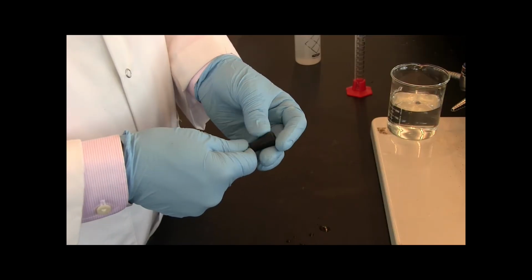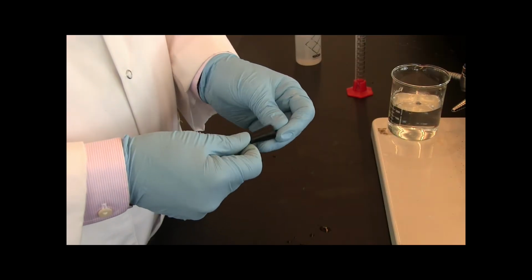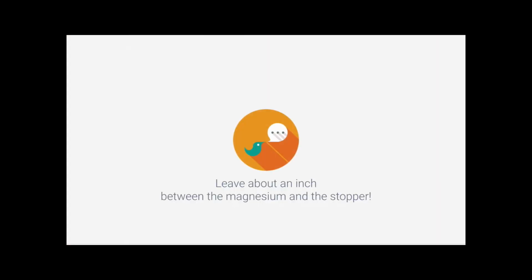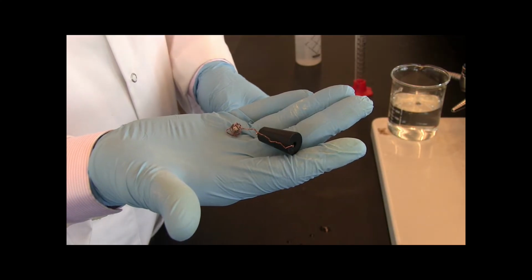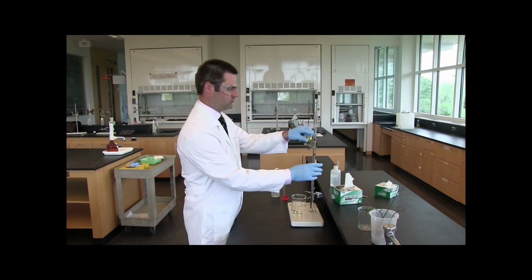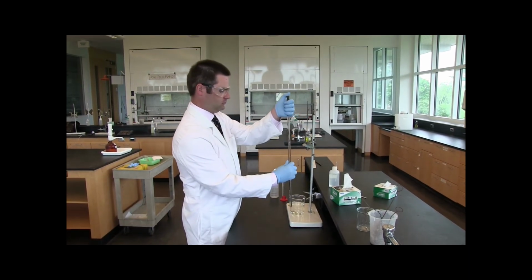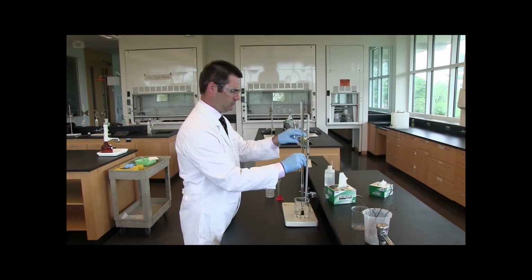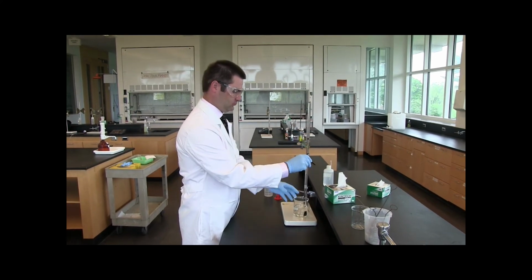Now you're going to thread the copper wire you wrapped around the magnesium through a stopper. Make sure you leave about an inch between the magnesium and the stopper, so your final should look like this. Next, you're going to place the stopper in the tube and then quickly invert the tube so the stopper is submerged in the beaker you filled with the tap water. You want the stopper about an inch from the bottom of the beaker.